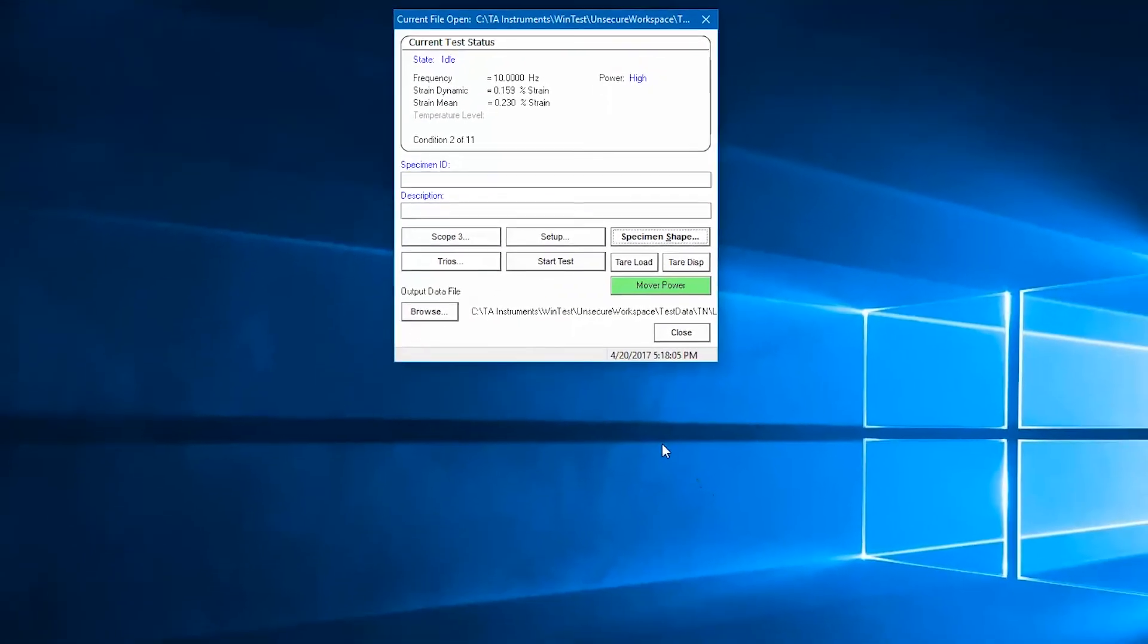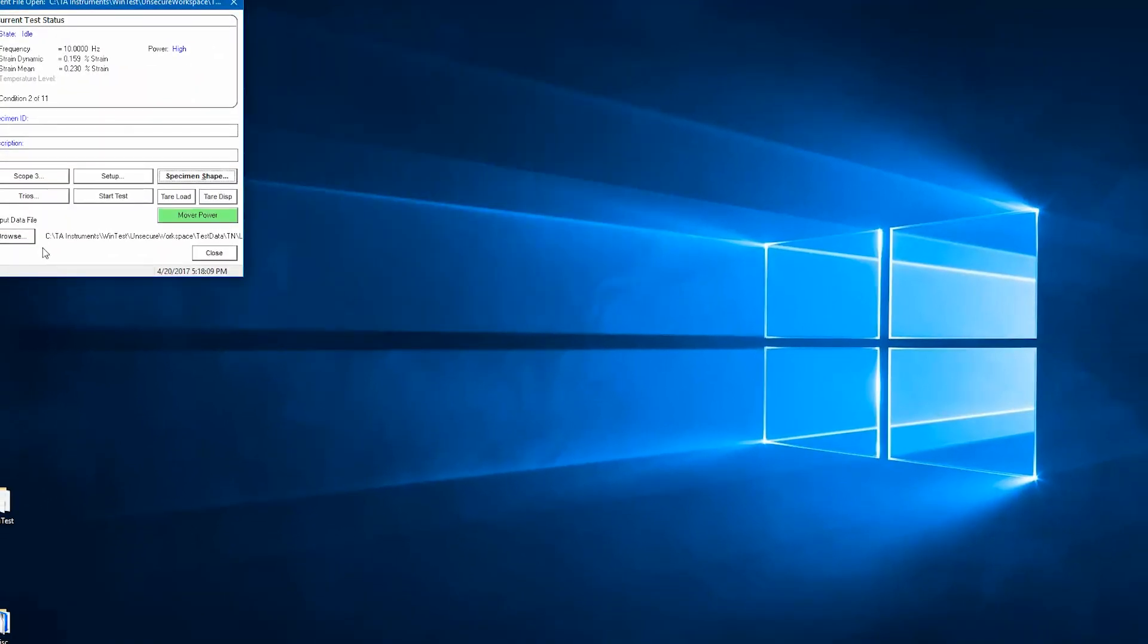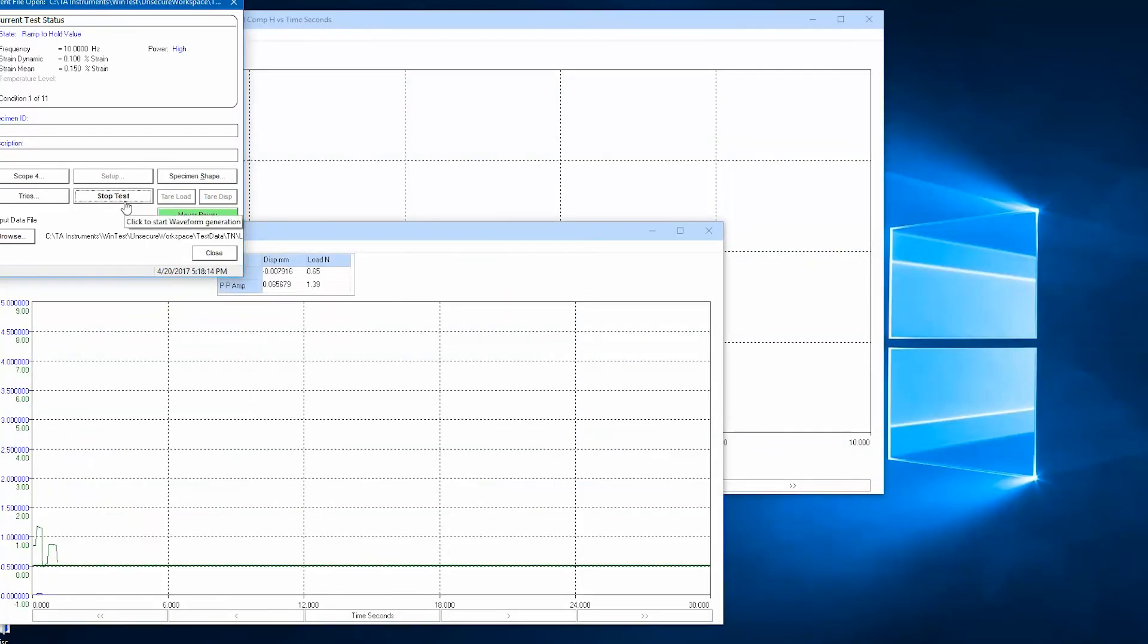WinTest can now use that displacement channel to effectively measure the gauge length of my sample. Now, I've fully entered my specimen shape information and am ready to run my test.